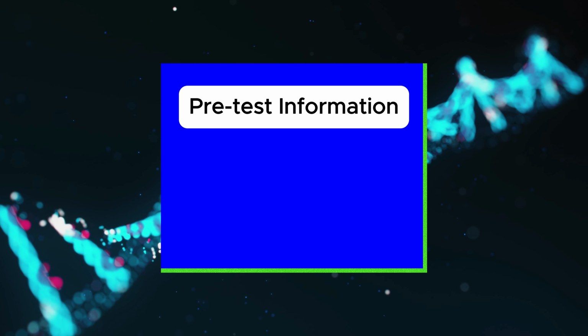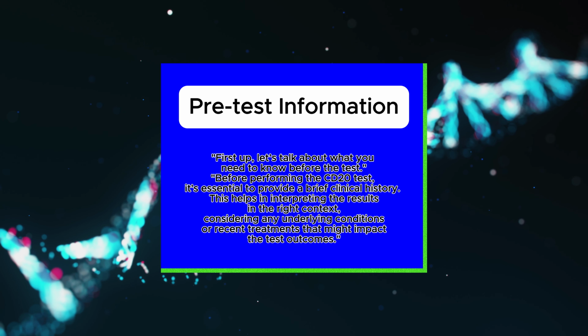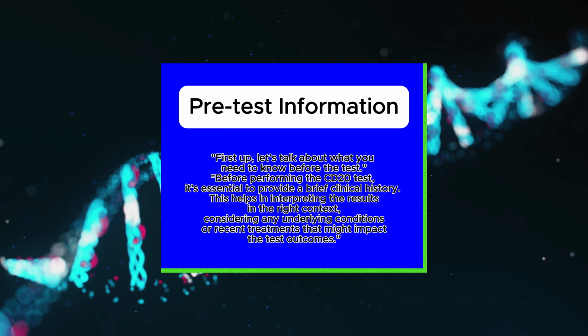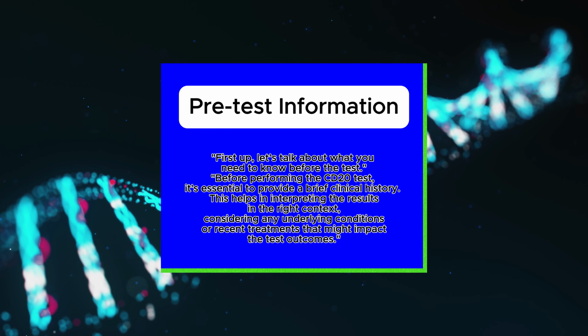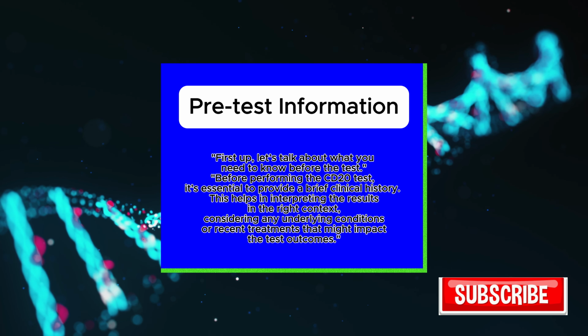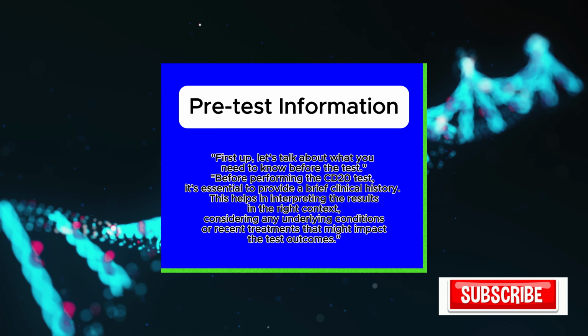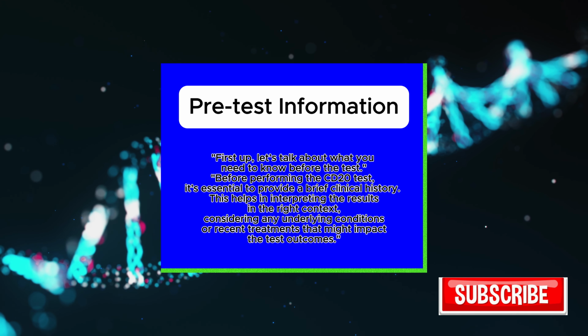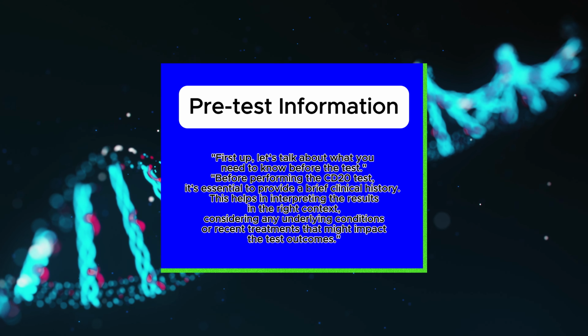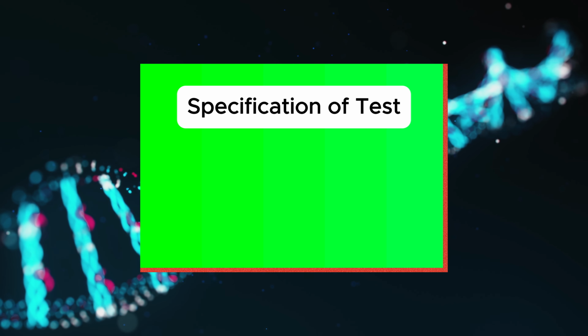Pre-test information. First up, let's talk about what you need to know before the test. Before performing the CD20 test, it's essential to provide a brief clinical history. This helps in interpreting the results in the right context, considering any underlying conditions or recent treatments that might impact the test outcomes.